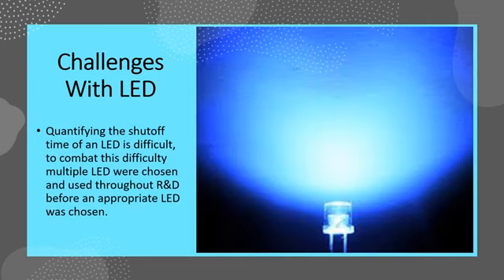Now, you may know the shutoff time of that LED due to its data sheet, but you're never really going to know how it'll work in conjunction with the designed circuit. So, we chose multiple LEDs and ordered them, thankfully due to their cheap price, and we were able to use them all throughout our R&D process before an appropriate LED was chosen for the final design.